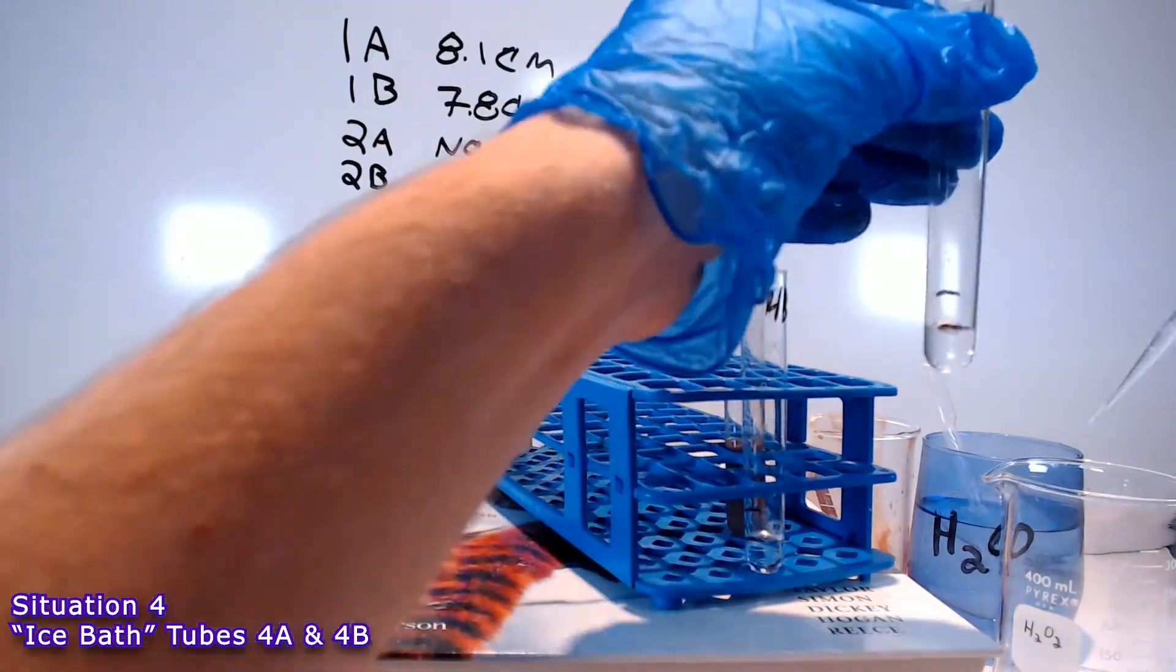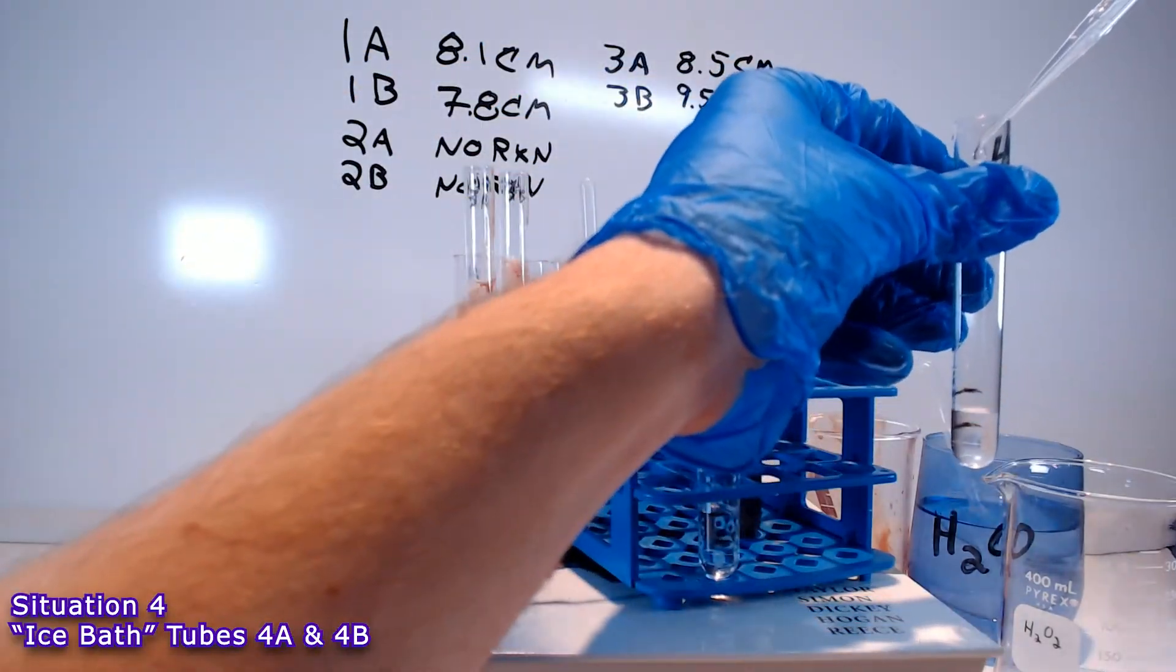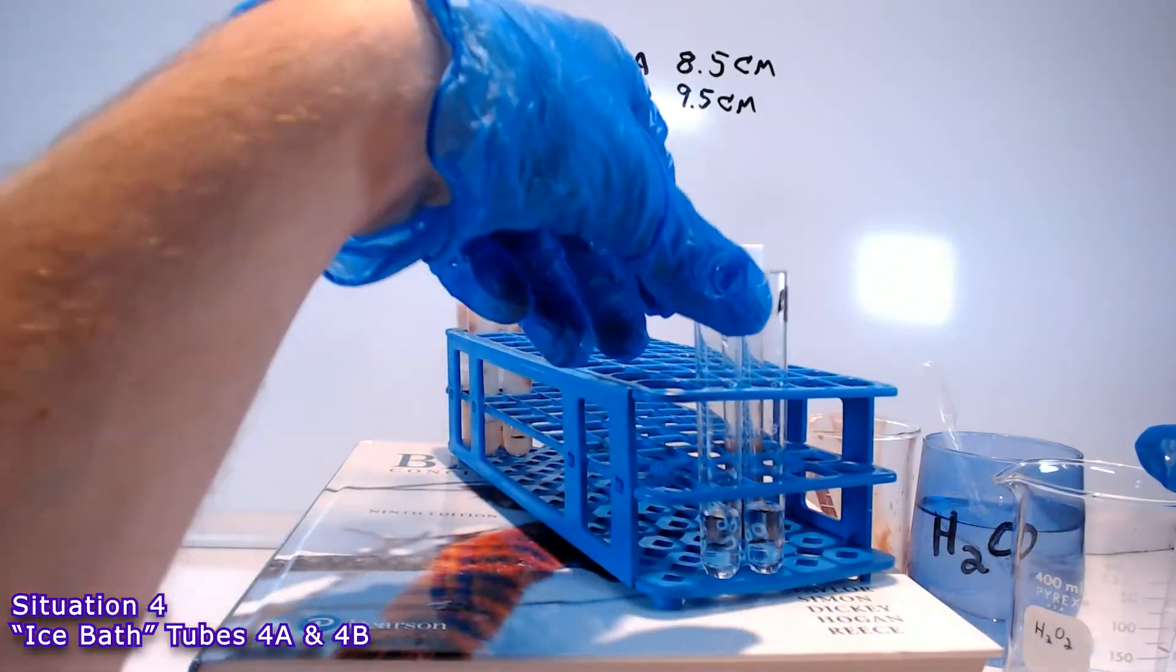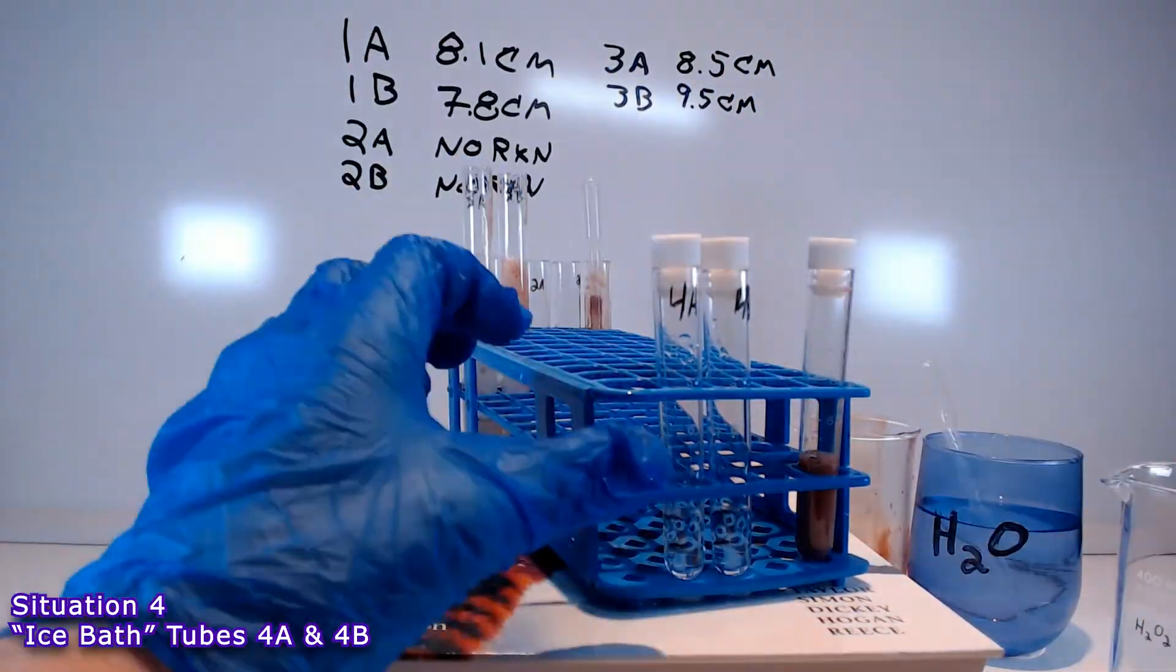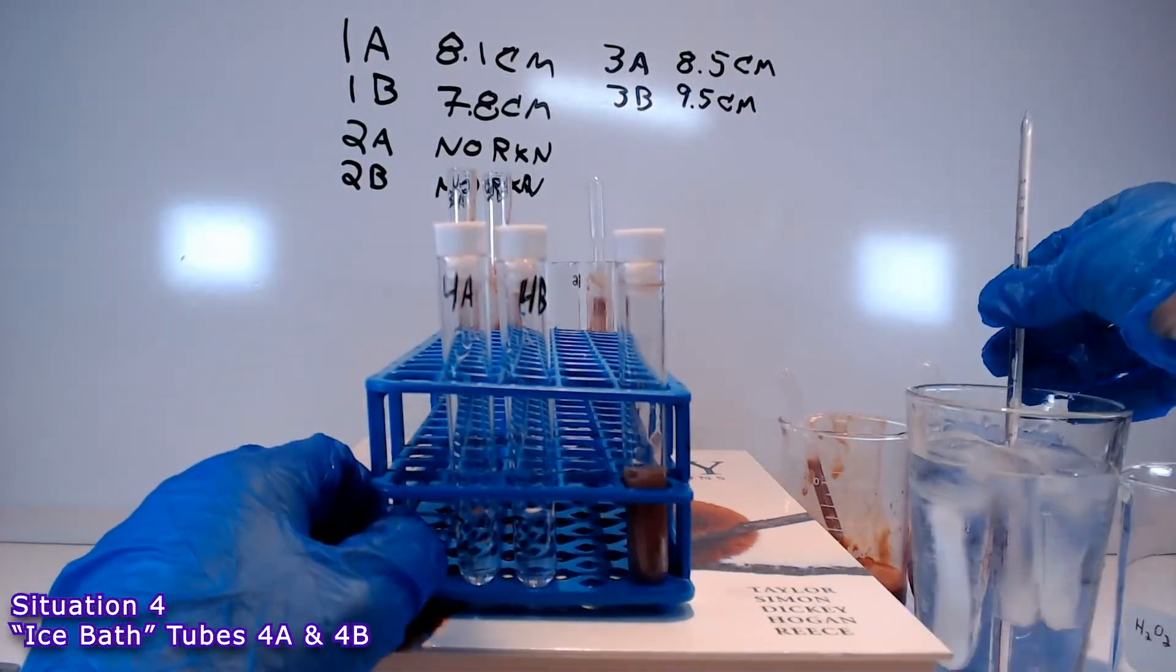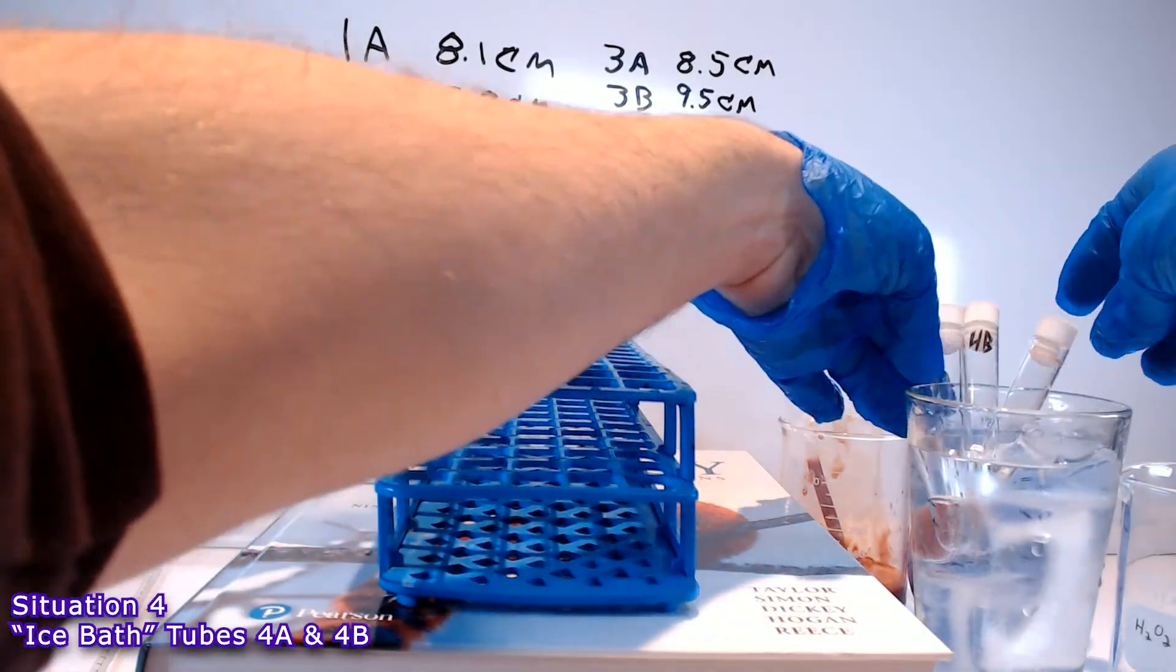In situation 4, we're going the opposite direction. We're going to create a cold environment by putting these tubes on ice. So, once again, this is water and hydrogen peroxide in the tubes. We're going to take tubes 4A and 4B and a sample of the liver homogenate. We're going to put it on ice. After 5 minutes, they have been chilled down adequately.